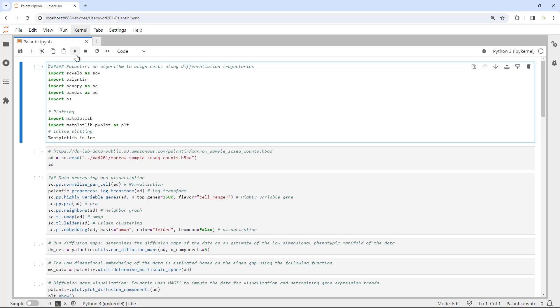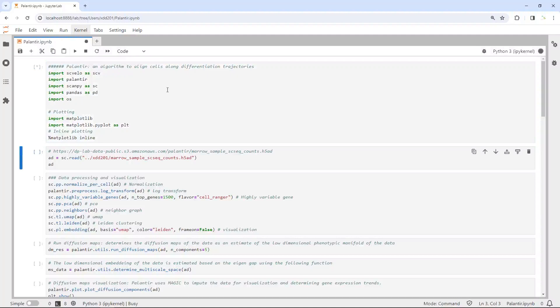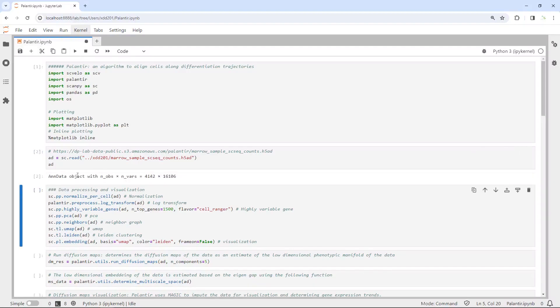First, let's load the required packages for today's analysis. Next, we can load the data. We are going to use the bone marrow sample data for today's demonstration. You can use this link to download the data. The data was provided by the Palantir online tutorial. We can just read the data into AnnData. At the moment, we have 4,142 cells and 16,106 genes, and we don't have any other data information for this dataset.